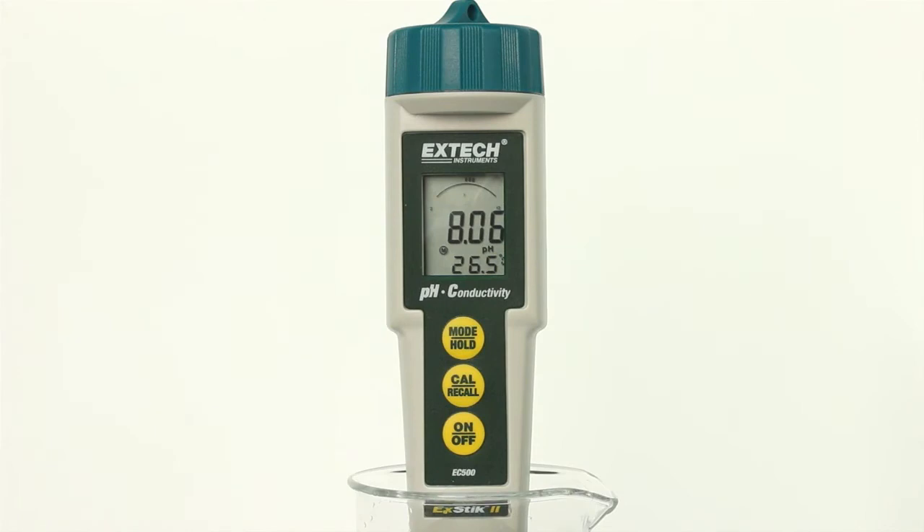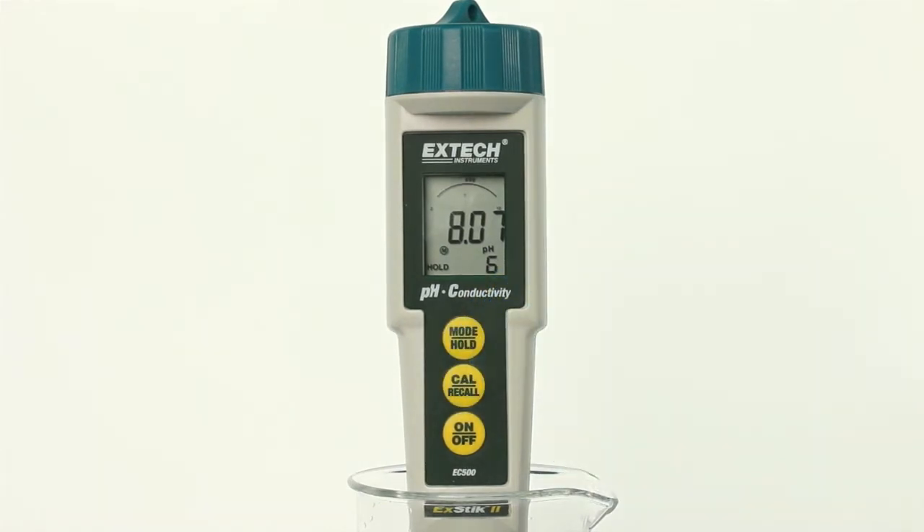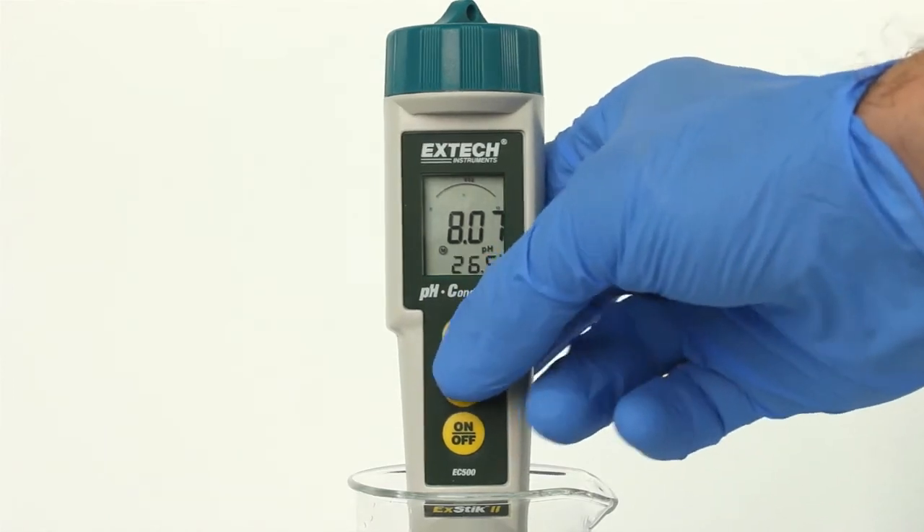Press the mode/hold button to hold a reading in the display; the hold indicator will appear. This also stores the reading. Press the mode/hold button again to return to normal operation.